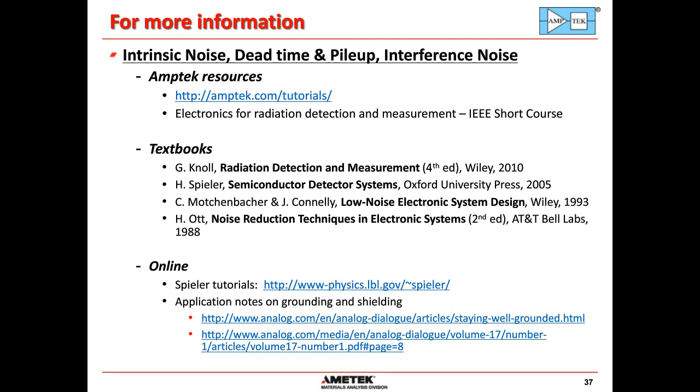Again, there's no one-size-fits-all solution to either thermal design or interference design. There's just a number of good principles. A fan will not only produce microphonics, it has the potential to produce EMI, so you simply have to experiment with what works best in your application.